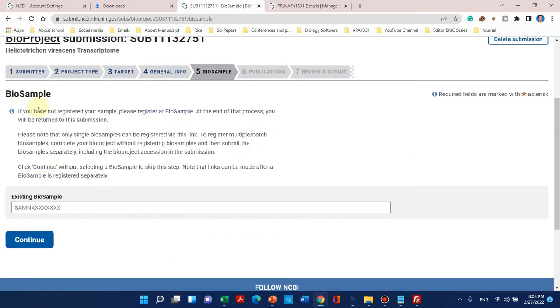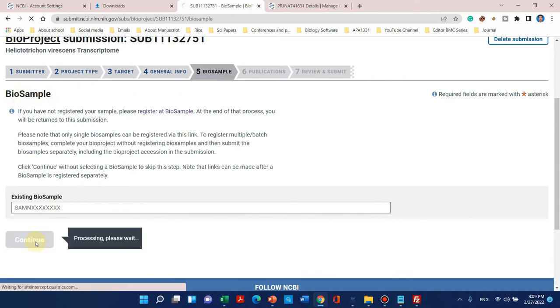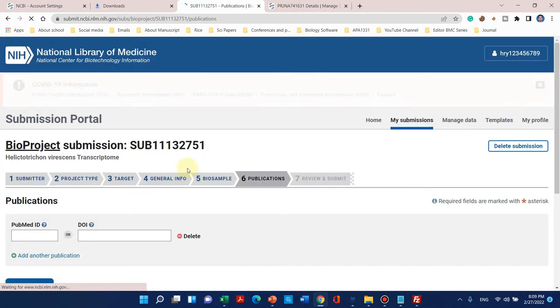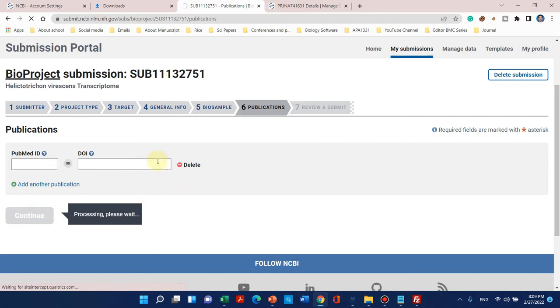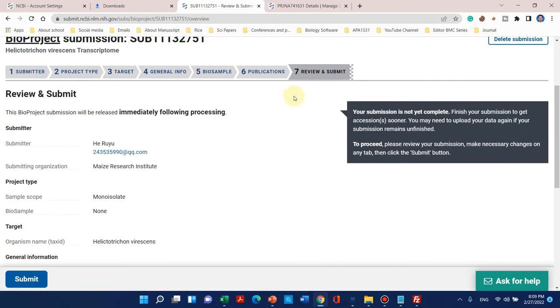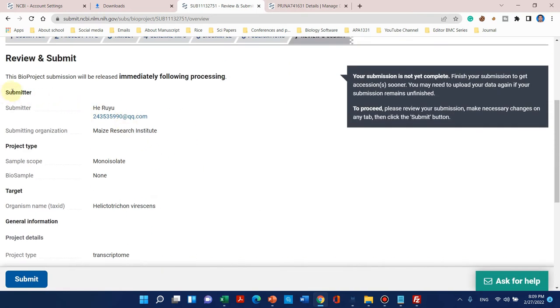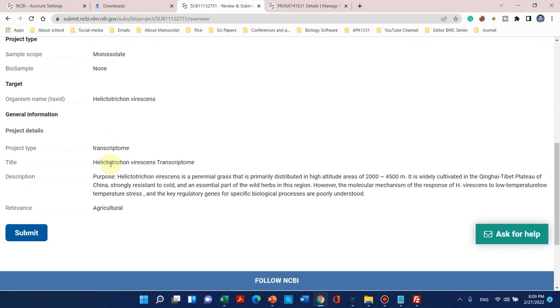It is asking whether you have already registered any existing BioSample. Since we are on our third step, we have not recorded any BioSample information yet, so we can leave it empty. We can also add a publication link later once our paper is online. So I can simply click continue. You can review your information: submitter, project type, target, and general information, and then simply submit.